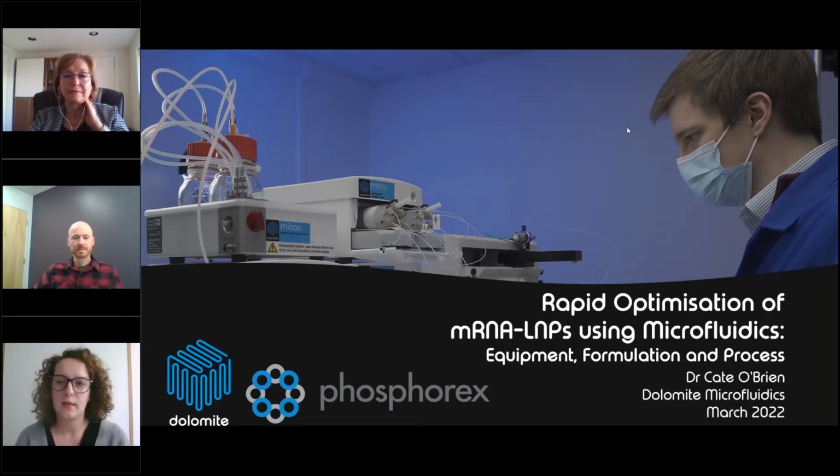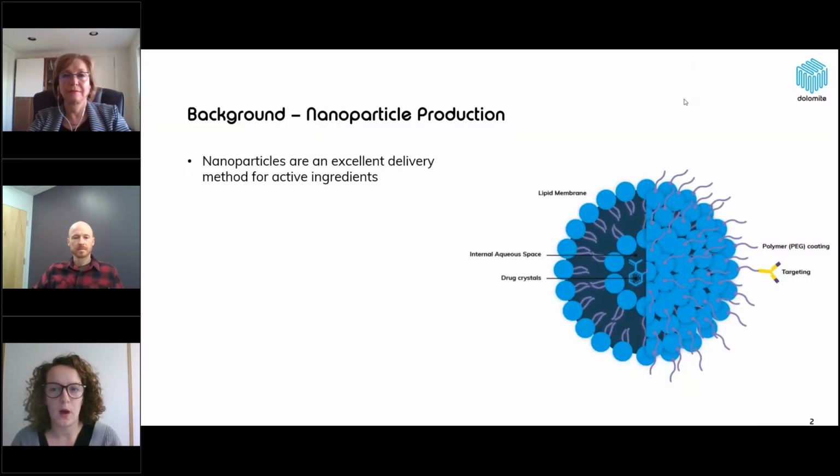Thank you for joining us today on our webinar about rapid optimization of mRNA LNPs using microfluidics. As everyone is probably very well aware, nanoparticles have been used very widely over the last decade or so as an excellent drug delivery method for a range of ingredients. Specifically, LNPs have been used as drug delivery vehicles due to their cell-like structures you can see in this figure on the right-hand side. And this gives them really good biocompatibility, so it allows them to be taken up in cells quite easily.